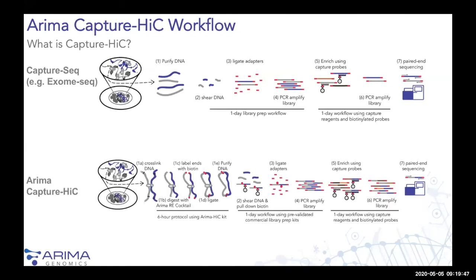Now, the way that Arima Capture Hi-C is different is this process of extracting the DNA is simply replaced with doing Hi-C. So instead of just extracting DNA, you go through the process of digestion, biotin fill-in, proximity ligation, and then DNA purification.